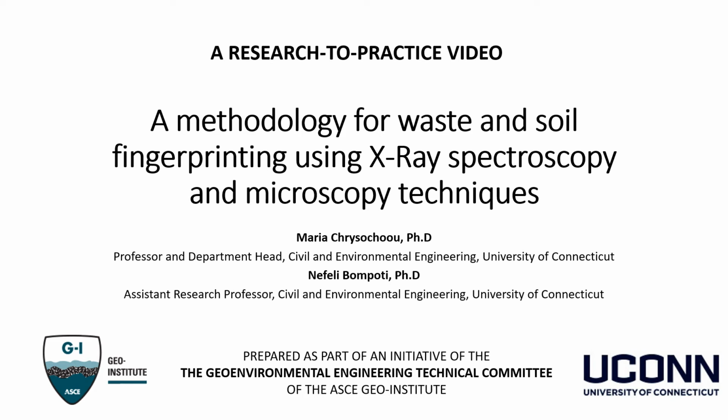This is a research to practice video that was prepared as a part of an initiative of the Geo-Environmental Engineering Technical Committee of the Geo-Institute. My name is Maria Chrysochoou, and I'm a professor at the Department of Civil and Environmental Engineering at the University of Connecticut. With my colleague, Assistant Research Professor Nefeli Bompoti, we will show a methodology for waste and soil fingerprinting using laboratory techniques including X-ray spectroscopy methods and microscopy.